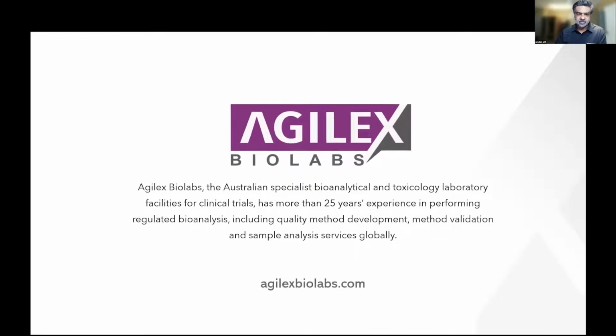All right, Kurt, thank you so much. Some of my questions might be reiterations of what you've just concluded, but thank you for your presentation. Tell us, Kurt, what are the advantages of digital PCR for measuring circulating DNA, ctDNA, and why is that important?